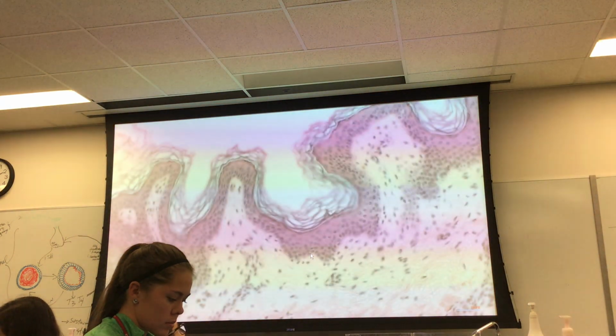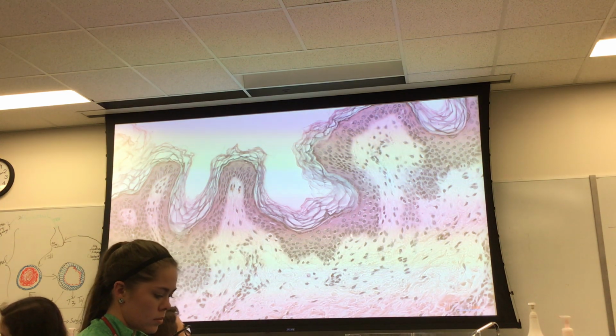Okay, so let's keep this going. I thought those were red blood cells. Okay, so what kind of an epithelium is this?